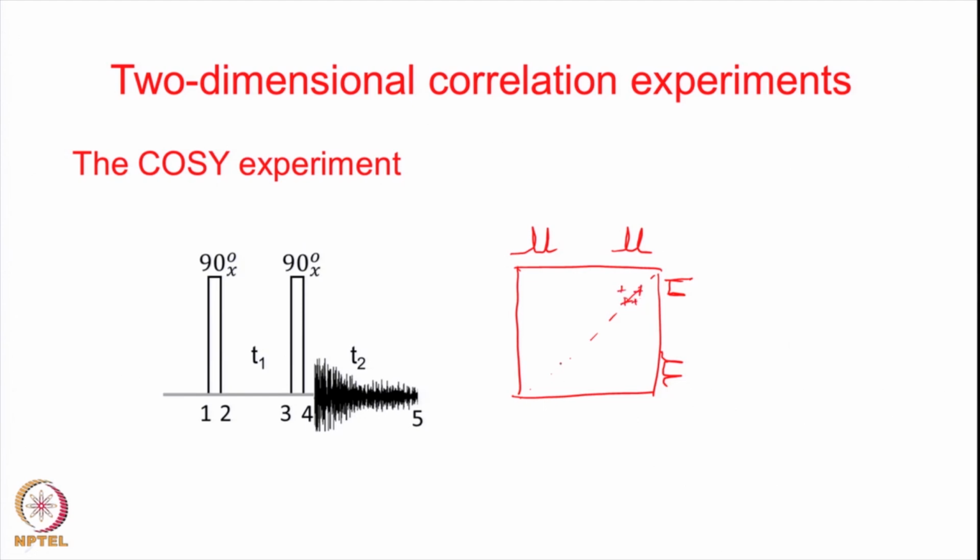These are the so called diagonal peaks, and they will have a fine structure which displays the coupling between the 2 protons, and we also said that we have this sort of a display of signs in the diagonal as well as in the cross peak. This was arrived at by using a detailed product operator formalism, and we said that this is the so called diagonal peak, and this is the so called cross peak, if I call it as C. The same thing is true here.